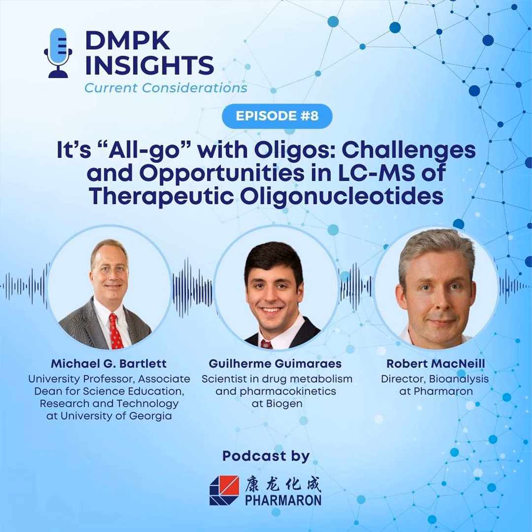That's sort of my concern with the whole SPE thing, is that non-specific adsorption in oligos is so much worse than it is in any other type of molecule. It's true. And using big surface area sample preparation is going to be problematic, and so you're going to lose something for doing that. And so I do think that potentially looking at the capture strands, because you can get away with not exposing them to as large a surface area, may work.